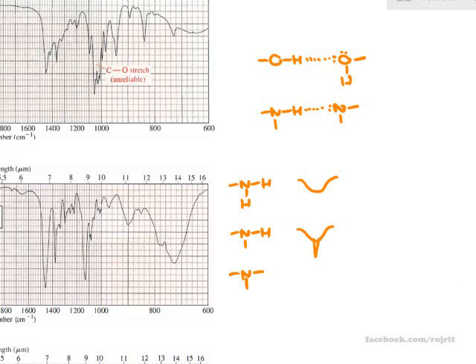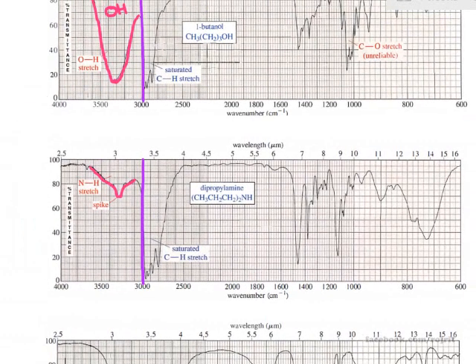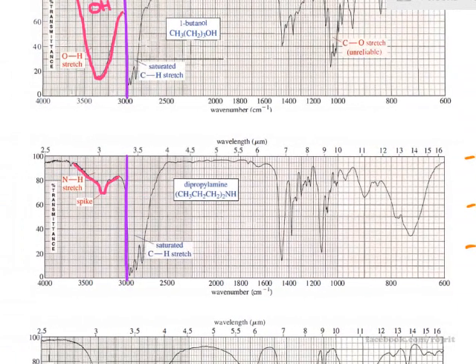If you have 2 hydrogen atoms, you will have 2 peaks. So count the number of peaks, then you know whether you have a primary or secondary amine. The 2 peaks belong to symmetric stretching and asymmetric stretching, similar to the aldehyde. Here you have 1 spike, so you have a secondary amine in the sample.